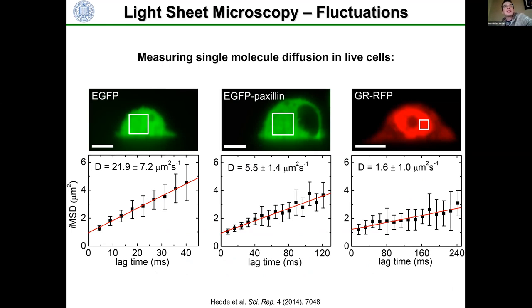Okay, so here are some examples of application of these techniques in live cells. On the left-hand column, we see a cell expressing the green fluorescent protein. The shape of the cell looks a little bit different than what you're used to. This is because you have to remember we are looking at it from a 45-degree angle, so we're slicing it in the XZ direction. This is why it looks maybe a little bit unfamiliar. Down here is where the cell attaches to the bottom of the dish.